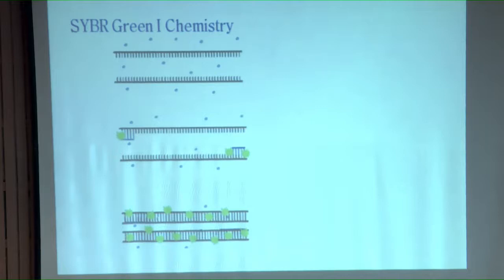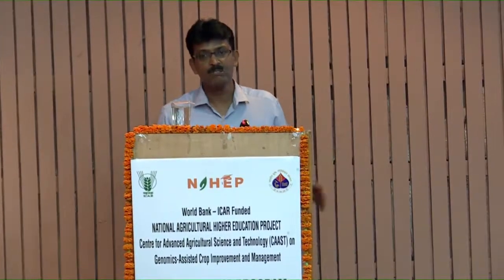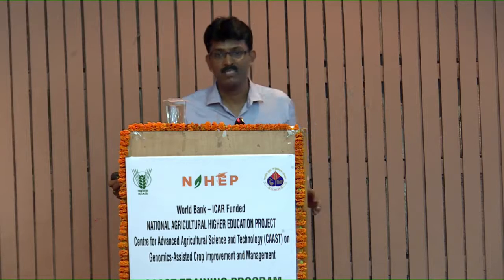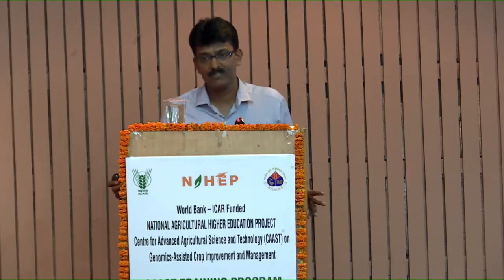Simple. Second cycle, it becomes 4 strands. What's happening here? The unbound dye in the PCR mix with every passing cycle is getting depleted, correct? So in other terms, the replicating double stranded DNA is going to capture this dye after every cycle passes, right?